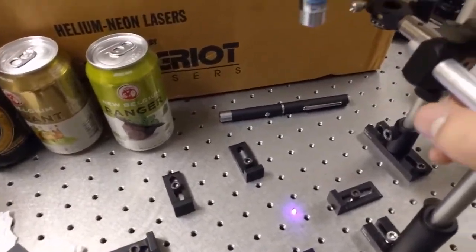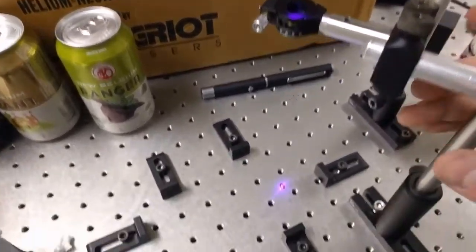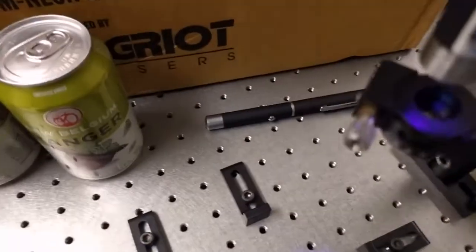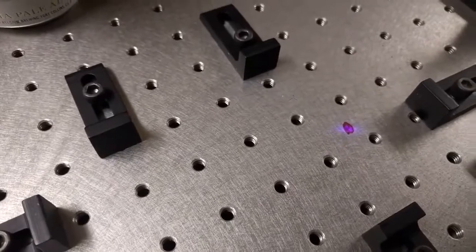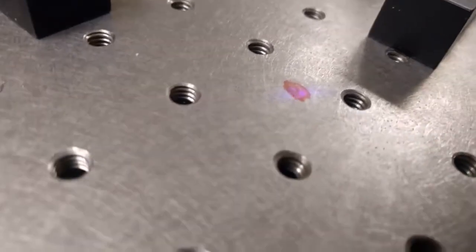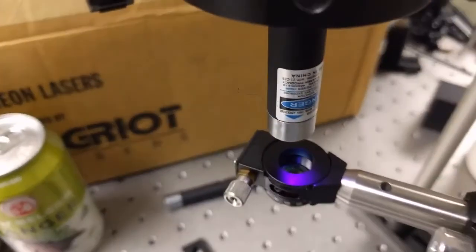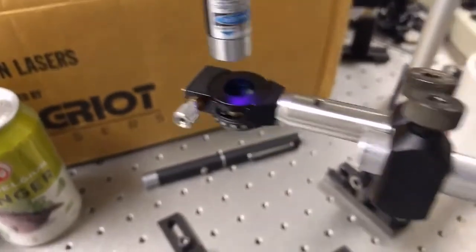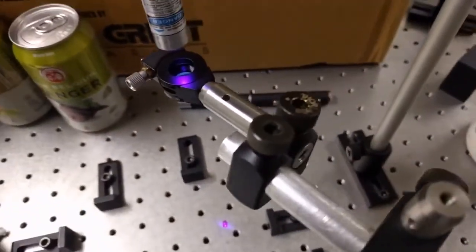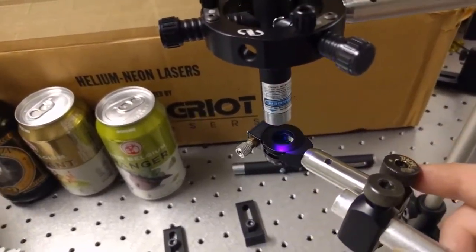Once this is done, the second part is to adjust the polarizer so that the light passes through the polarizer in a way that we minimize the amount of light coming through. If you can see there, you have a little bit of light left. This is because if you shine the laser directly onto the camera, it'll be too bright to notice differences in the intensity at different places. And there are a few joints here that we can use to adjust this if necessary. But for the purposes of this, you can just move it into place.